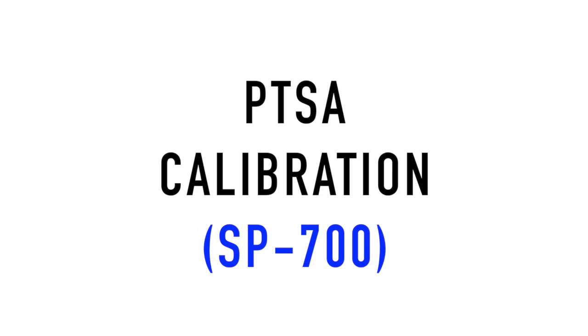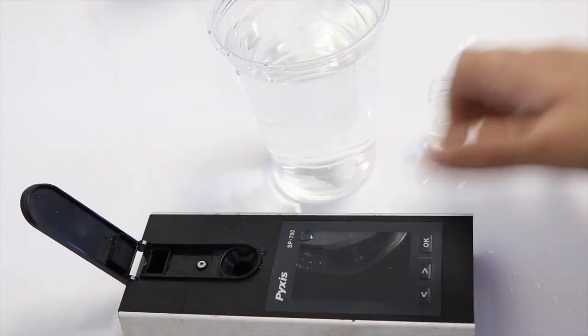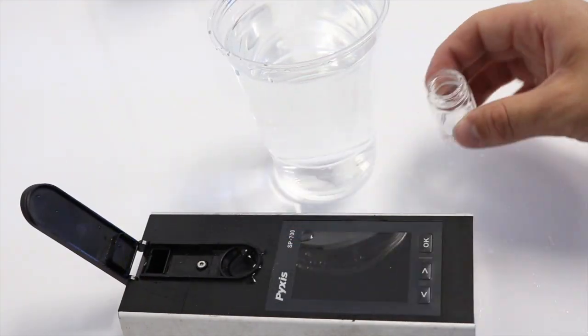This video is to display the general PTSA calibration for the Pyxis SP700 unit. Start by rinsing the SP700 sample cup with deionized water or DI water the standard three times.